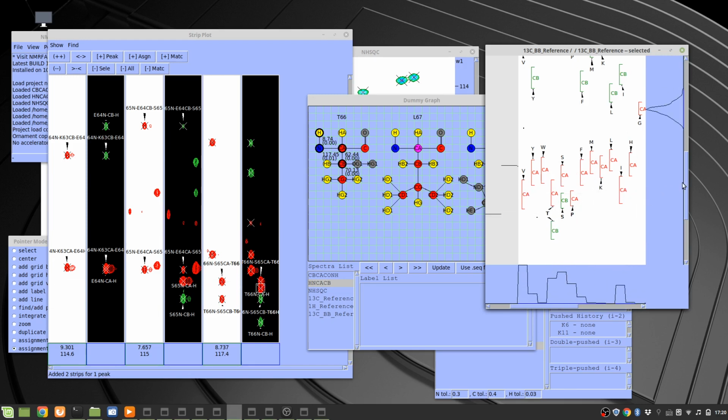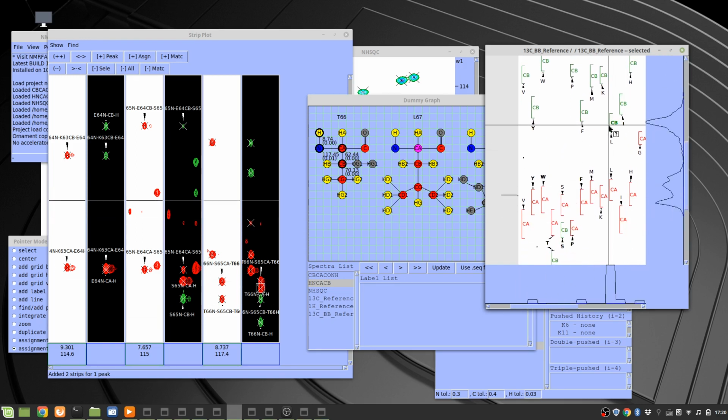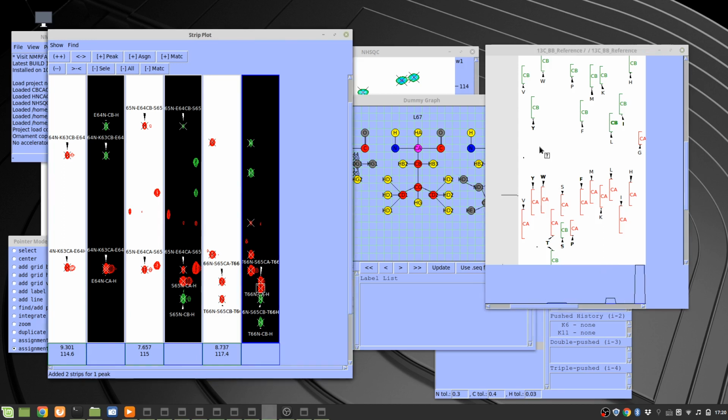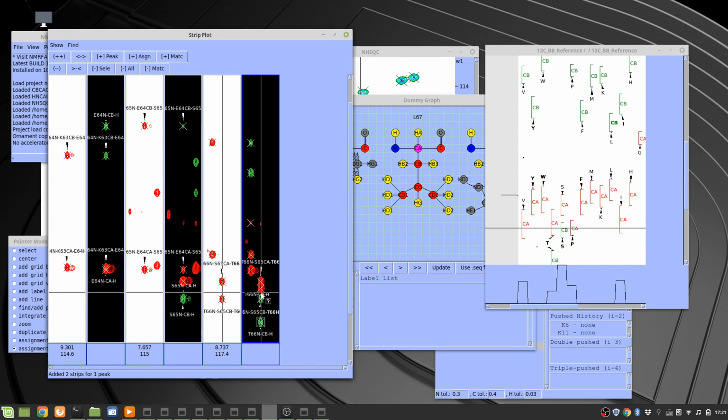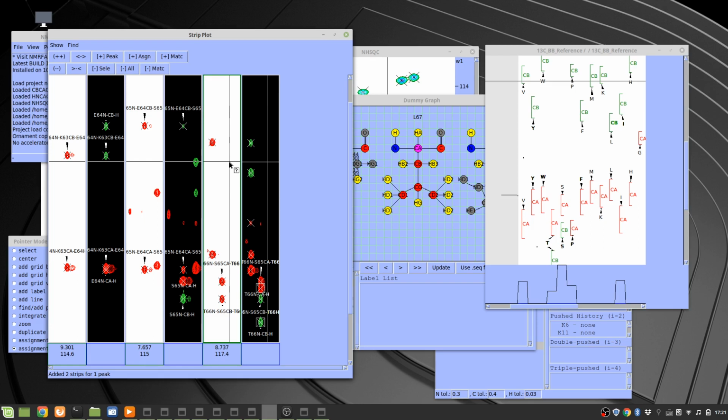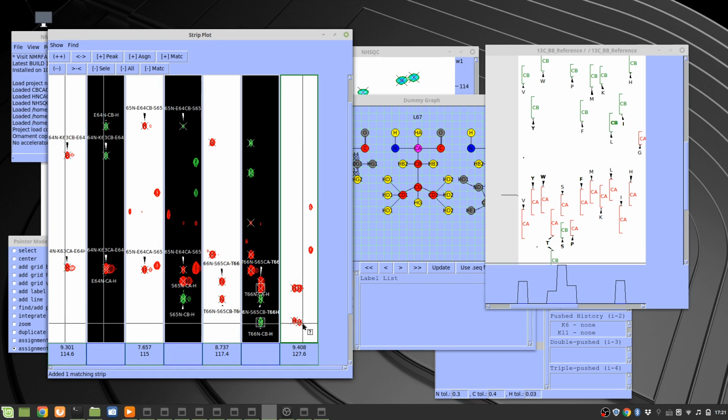So if you look at this chemical shift reference view, leucine is also very unique. Their carbon alpha and beta are very close to each other. So if you have multiple matching strips, you can expect that the ones with closer carbon alpha and beta will be more likely, because the residue type is leucine, right? So select threonine, alpha and beta, and then select CBCA(CO)NH, and then click this matching strip. Fortunately, we only had one.